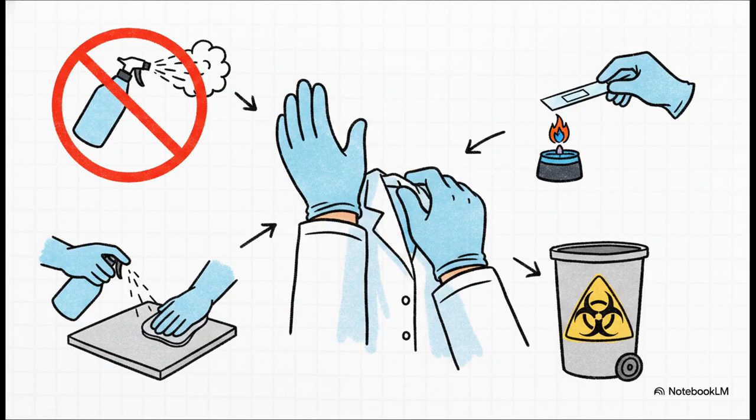And because we're dealing with live, potentially dangerous pathogens, biosafety is absolutely non-negotiable. You've got to wear gloves and a lab coat. You absolutely must avoid aerosol formation, meaning splashing or spraying the sample. Creating an invisible mist of bacteria is pretty much the fastest way for the investigator to get infected by the exact culprits they're hunting. Not good. Additionally, we have to flame our slides carefully, thoroughly disinfect the microscope stage after we're done, and strictly follow proper waste disposal protocols. Safety first, every single time.